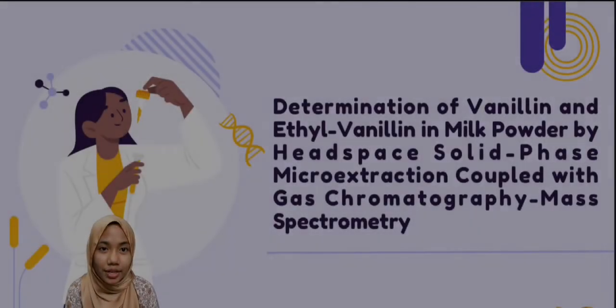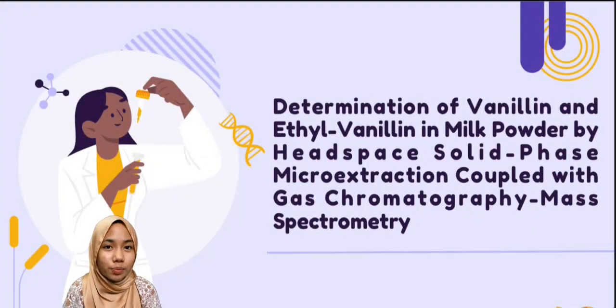Assalamualaikum and hello everyone. So today we are going to present about the determination of vanillin and ethyl vanillin in milk powder by headspace solid phase micro-extraction coupled with gas chromatography mass spectrometry.